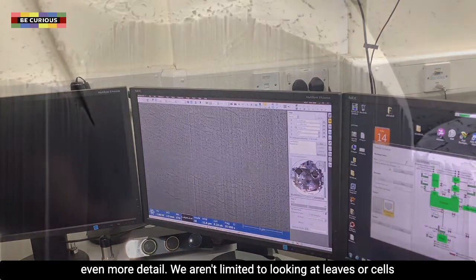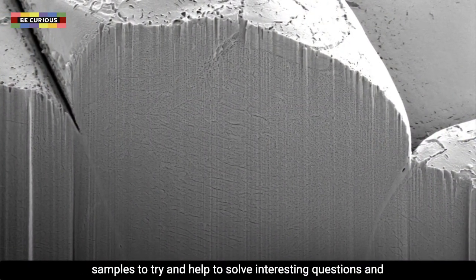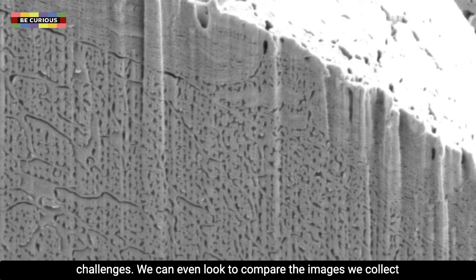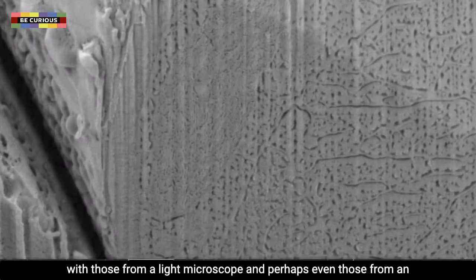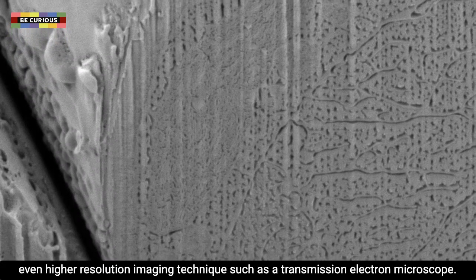Now we aren't limited to looking at leaves or cells. We can use a scanning electron microscope for many different samples to try and help solve interesting questions and challenges. We can even look to compare the images we collect with those from a light microscope, and perhaps even those from an even higher resolution imaging technique, such as a transmission electron microscope.